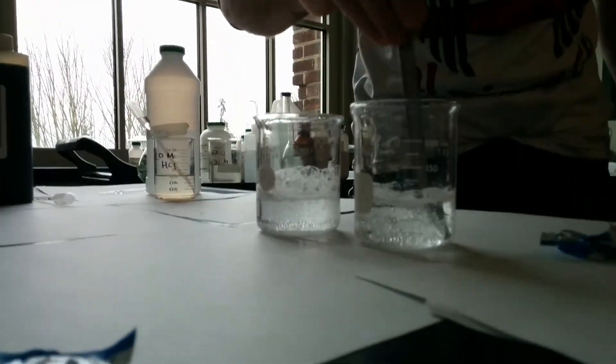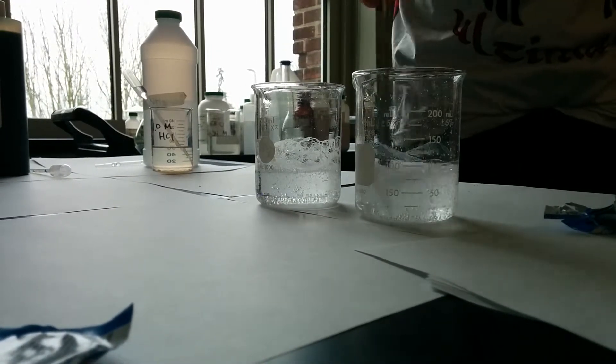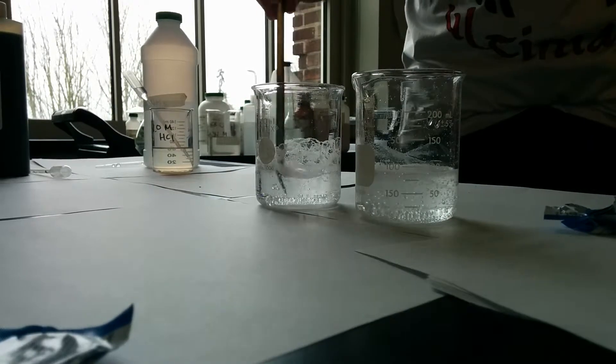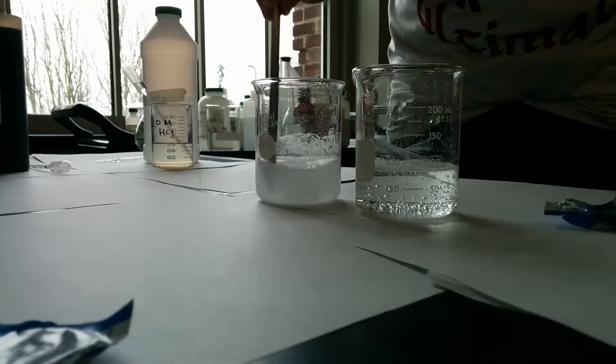So I'm going to give it a quick stir. Note: you should never use a metal object to stir in a glass container, because the glass container goes bang bang and then it breaks. But I don't have a glass stir rod right on top of it.